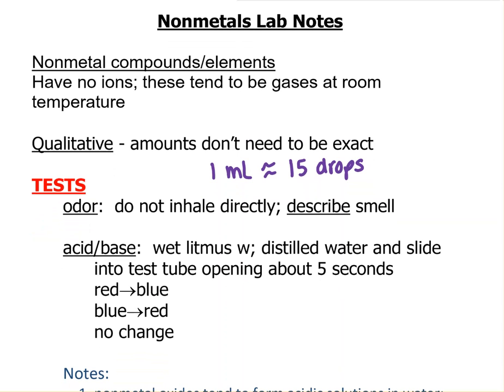So some of them have odors. You want to be really careful about how you smell them. Just use your hand and wave over them. Some of them will burn your nose. Do your best to describe their smell.